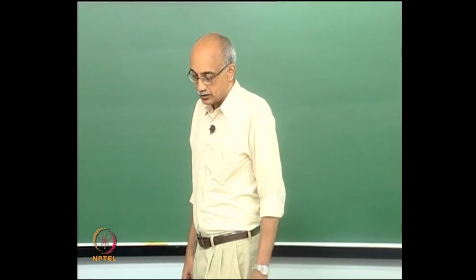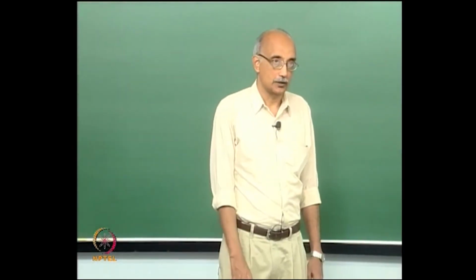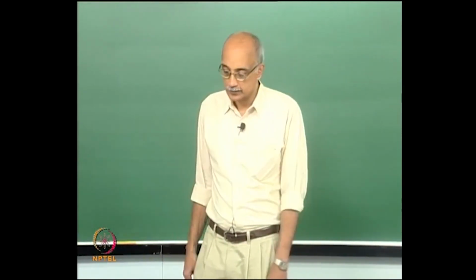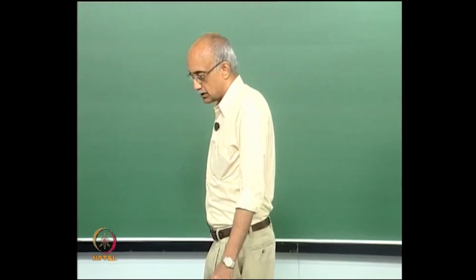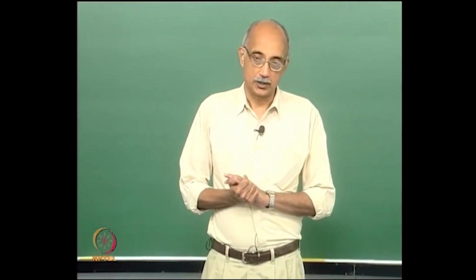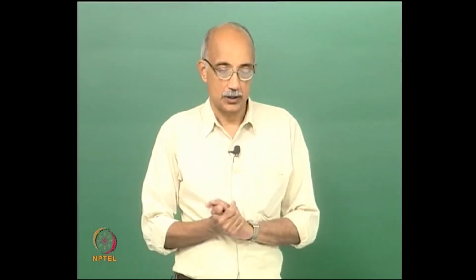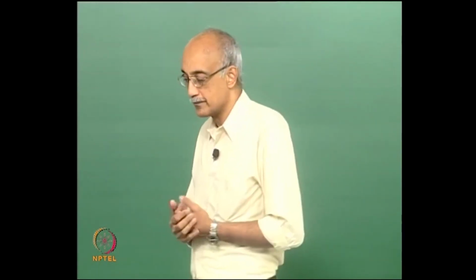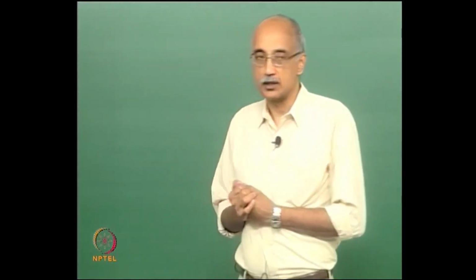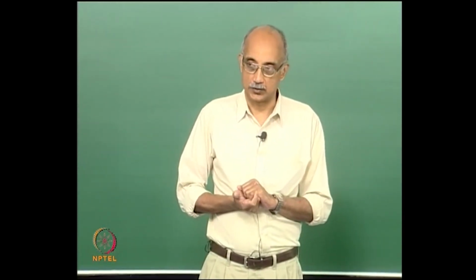Welcome to the 7th lecture in this particle characterization course. In the last lecture, we started discussing particle size measurement techniques, and I mentioned that essentially particle measurement strategies can be classified as being in static mode and in dynamic mode. So, we looked at a few examples of size characterization in the dynamic mode, where essentially particle populations are set in motion, and based upon their behavior under the flow field, we derive their particle size distribution characteristics.